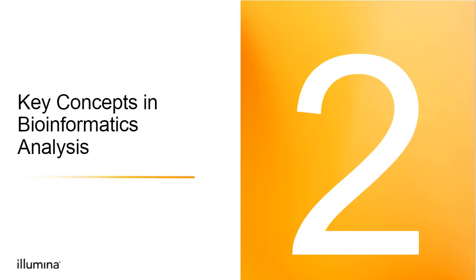With all the experimental design considerations behind us, let's get to the main portion of this talk, which is a discussion of key concepts in bioinformatic analysis. Of course, there are several flavors of analysis that can be performed. However, here we're looking to discuss basic concepts like alignment, variant calling, assembly, and RNA-seq analysis. At this point, we've planned our experiment, sequenced, and now we have our reads. So we're ready to move on to our analysis step.